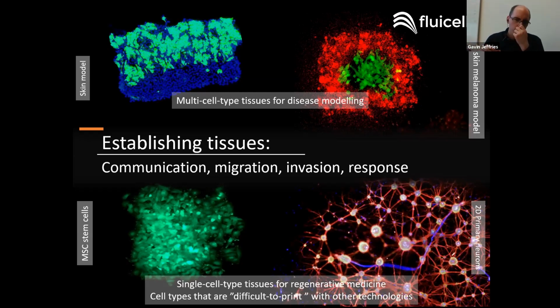The single cell types have also been investigated, but with the single cell types, the aim is more towards patterning sensitive cells, towards regenerative medicine applications. So within these areas, we've looked at patterning of stem cells, so mesenchymal stem cells, as well as iPSCs of multiple different origins. We also have looked at patterning very sensitive cells, such as primary extracted neurons, to see how the printing process can be utilized in very sensitive and very difficult to handle samples.